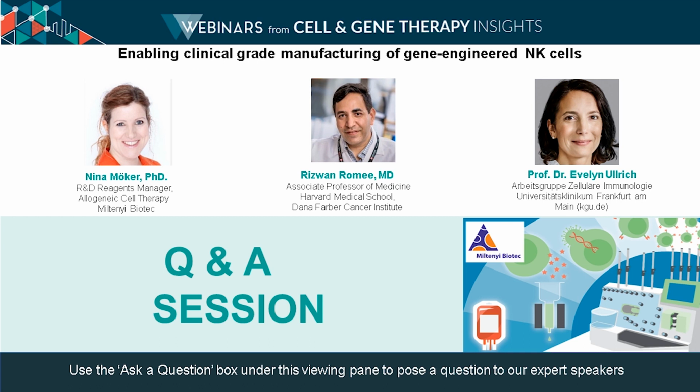Absolutely. Thank you, Nina. And Rizwan, do you want to talk a bit about how you've gone about this process? I agree completely with Nina. So I moved a few years back from WashU to Dana-Farber to lead the NK cell program here. And I thought it would be super easy. We have an outstanding GMP facility, but then I realized that starting something from scratch is challenging. Even though we had a fabulous GMP facility, unless you have experience with NK cells, there are some unique tweaks you have to make sure you do before everything works, and so the validation runs and things like that.